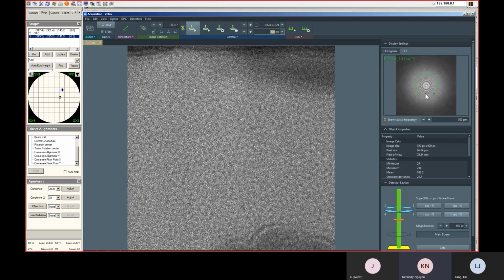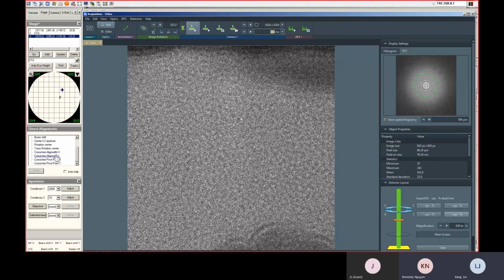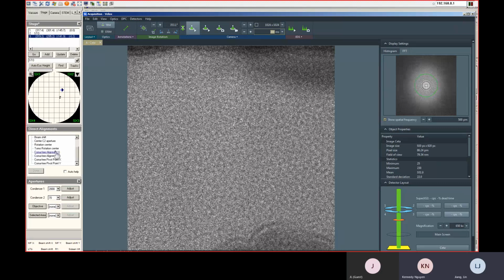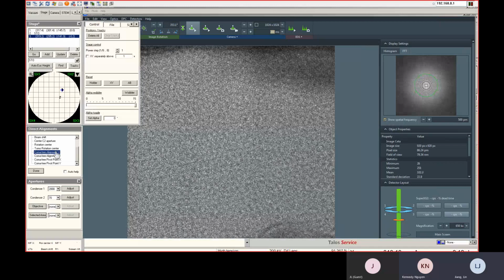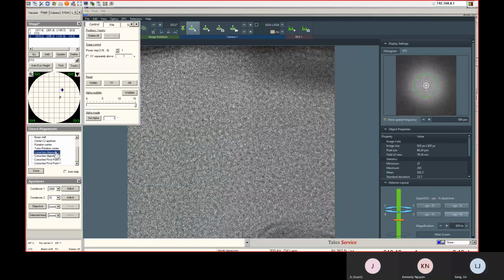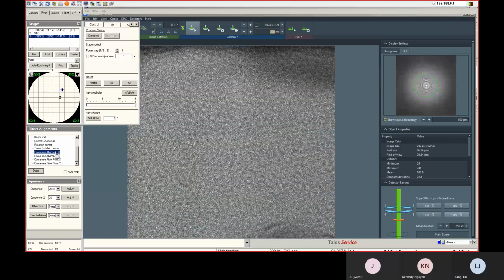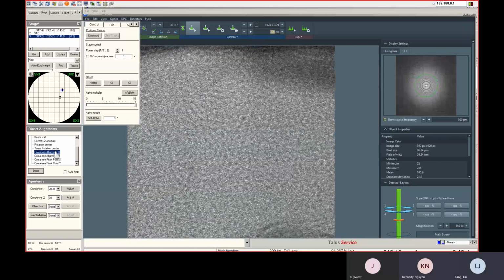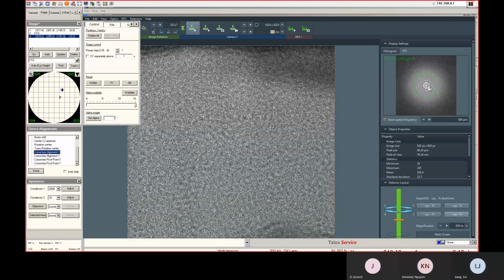All right. The objective looks pretty good. So we'll do coma-free X. It's slow. Okay, nothing's changing, right? It's changing the size.